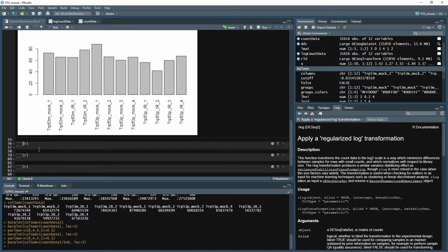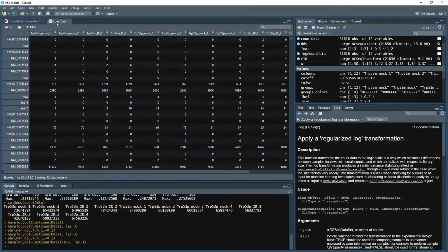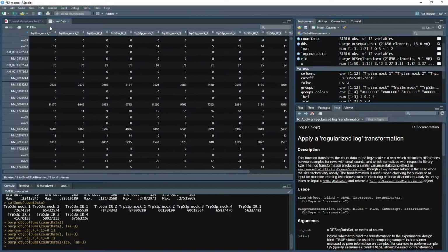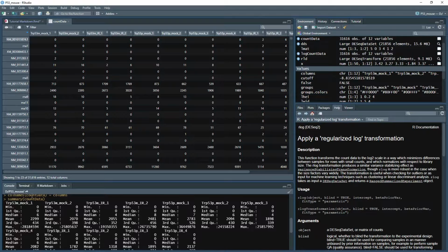Let's look within each file. In each sample, we see that we have a lot of zeros, a really low number. Well, this is log count; we're going to make log count. We have a lot of zeros here. It looks like the majority of them are actually 0, and we saw that up here with the summary too. We can see all the way up to 25% of the number of samples have 0 in there.